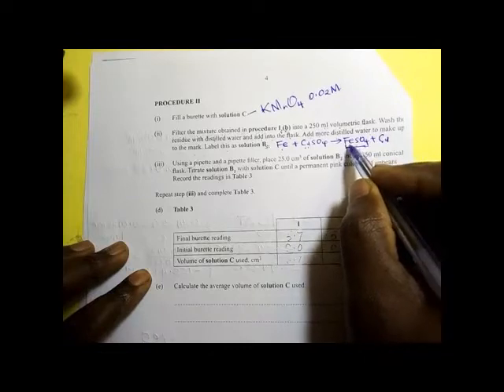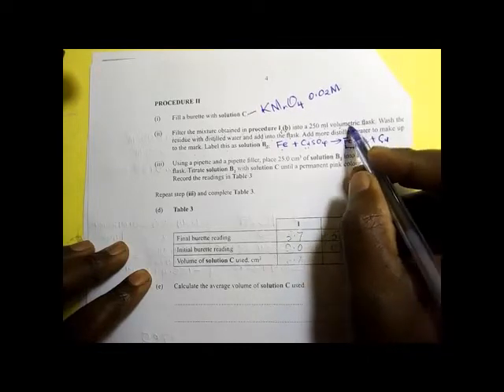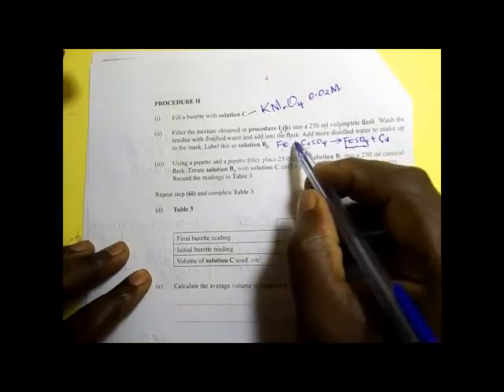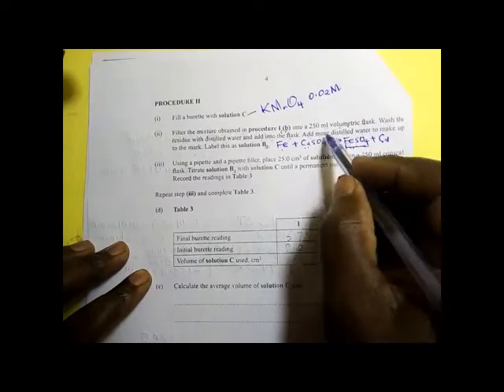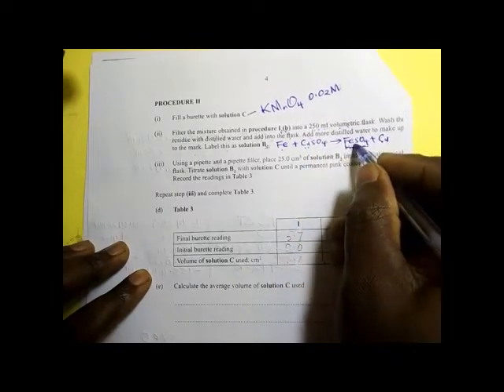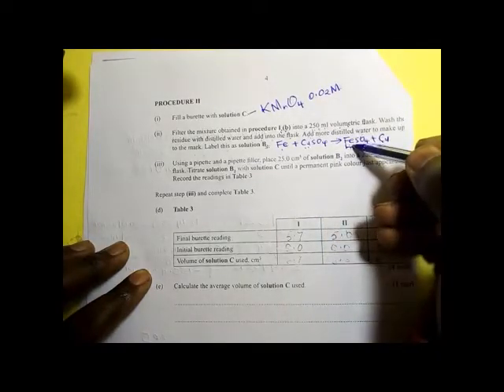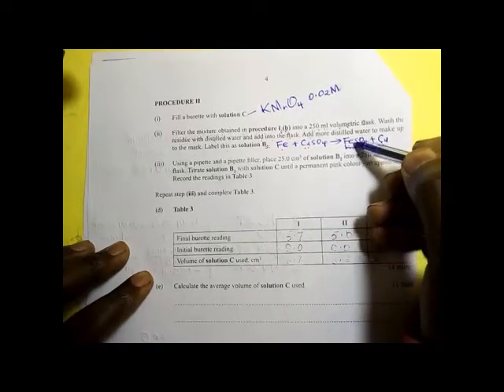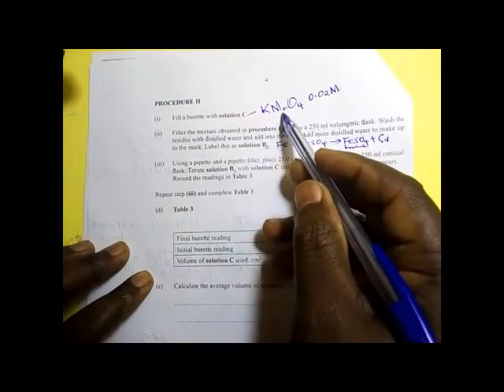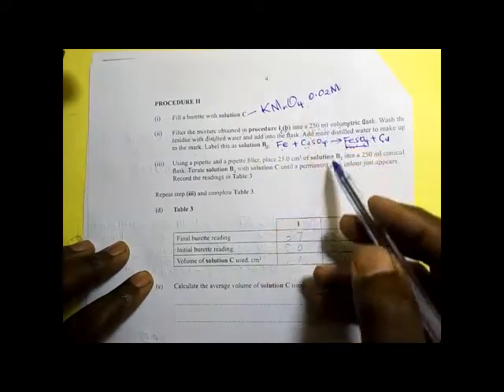Now we are putting this solution into a volumetric flask and then adding distilled water to the mark, where we will have a total volume of 250 centimeters cube of iron 2 sulfate. So we are going to react iron 2 sulfate with acidified potassium permanganate, right? That is the understanding you need to have.